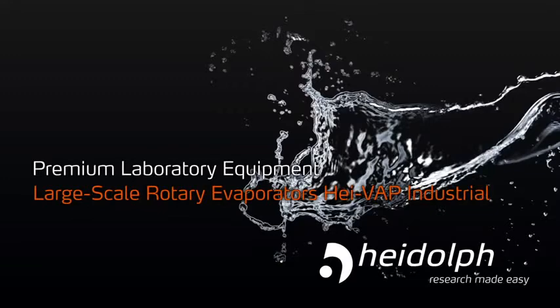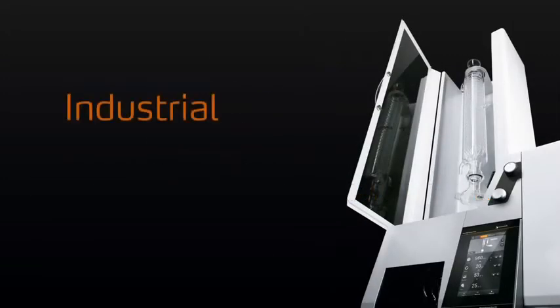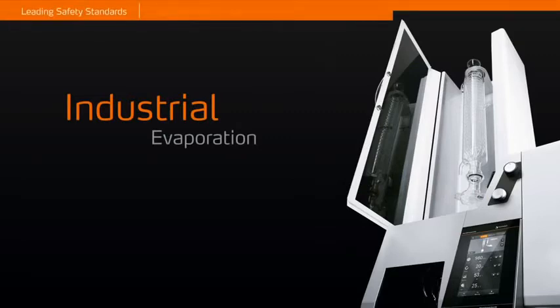Large-scale rotary evaporators of the HIVAP Industrial Series. Industrial Evaporation.